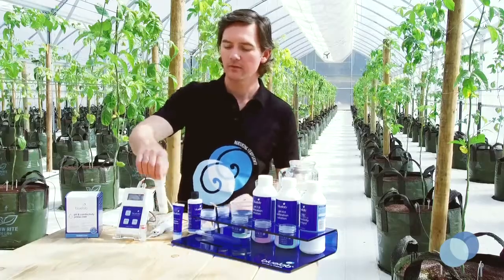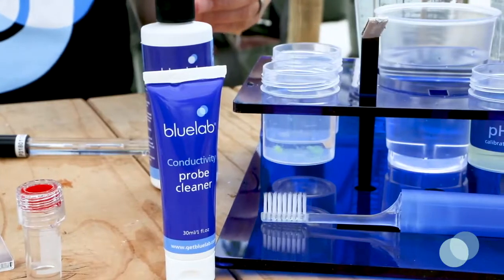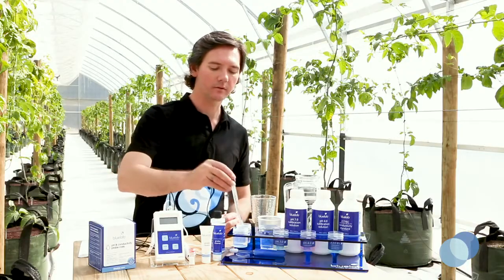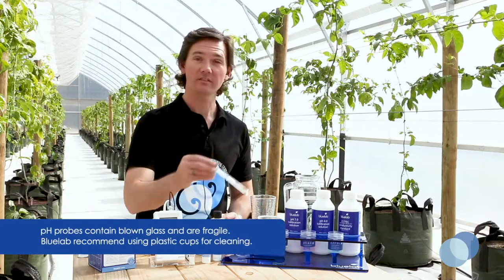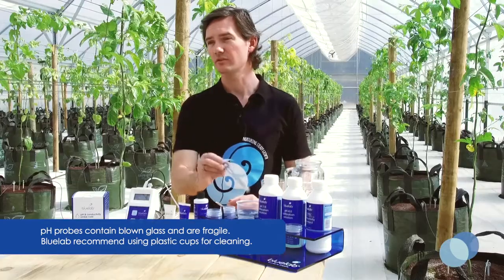Next, get a container with some fresh clean tap water and put in a few drops of Bluelab pH Probe Cleaner. Gently stir the probe in the cleaning mixture, then rinse it in fresh clean tap water and make sure all traces of cleaning solution are removed.